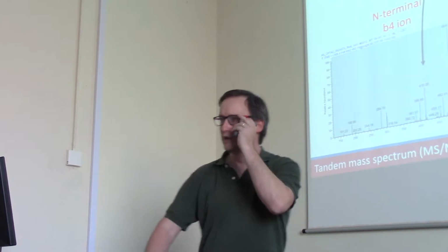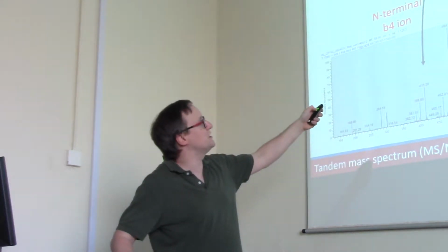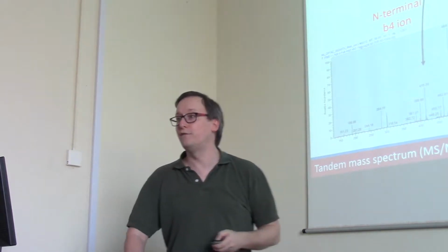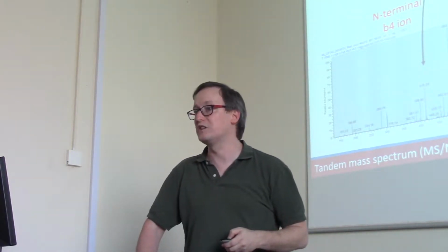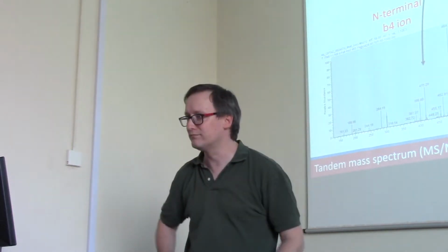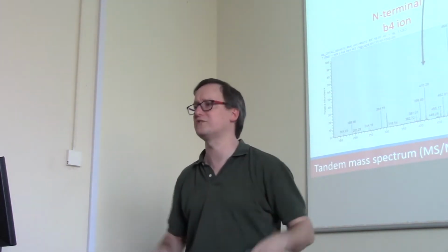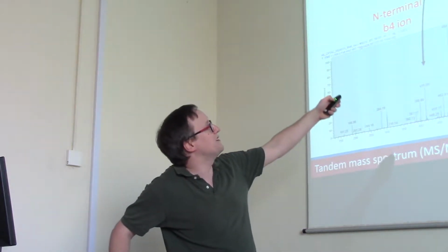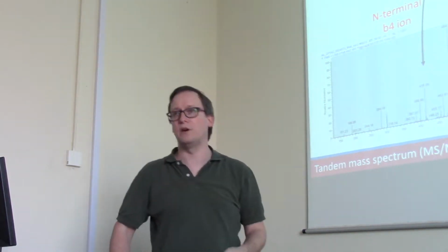Good catch. So let us imagine that the fourth peptide bond, 1, 2, 3, 4, is going to be cleaved in a collision-induced dissociation shattering. I'm not going to get into all the magic of how CID happens. We blow them apart. That's good enough for now. So we have this breakage of the fourth peptide bond.